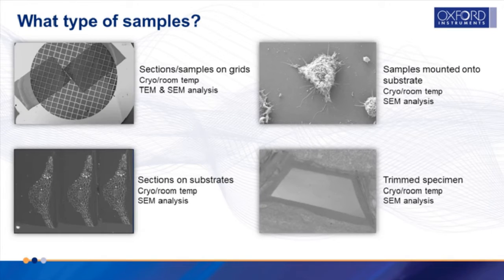One of the questions I frequently encounter is what type of biological sample can we do EDS on? If you can prepare a sample for electron microscopy, then you can do EDS on it. Like all electron microscopy, you need to prepare your sample in a way that it answers the questions you are trying to address. Erin will be discussing sample preparation in more detail later as it relates to their research question.